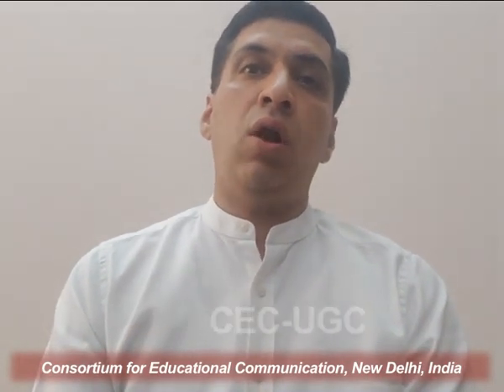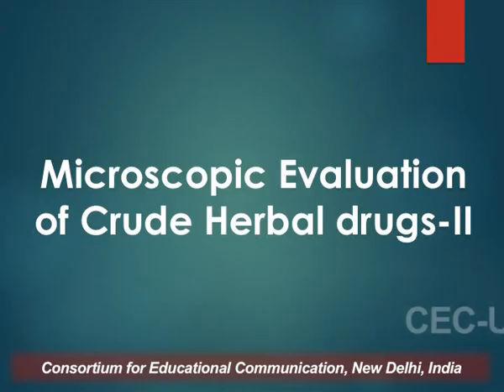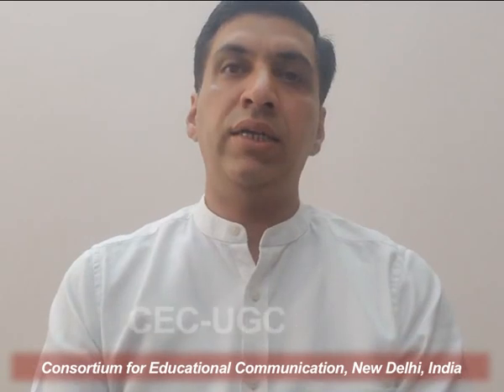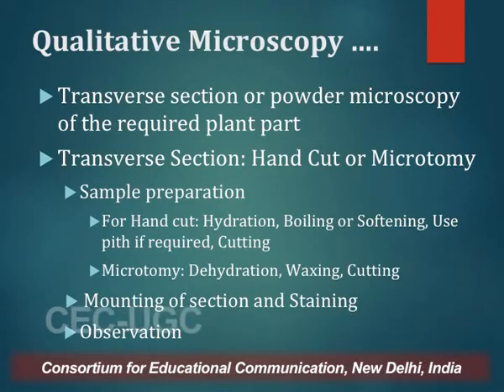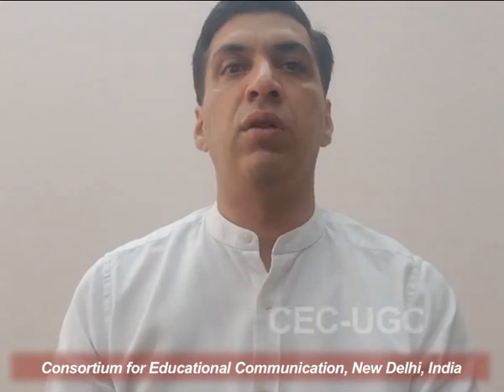Now, in continuation with the previous lecture, today I'll start with the second part of microscopic evaluation of crude drugs. As I told you, in qualitative microscopic evaluation, we study different types of microscopic characters. Now, these microscopic characters can be studied either in a transverse section of the required plant part or through powder microscopy if that plant part is provided in the powdered form. Now, I'll just go briefly through the methods by which we can prepare the sample or cut the transverse section, and how we can prepare the sample for powder microscopy.